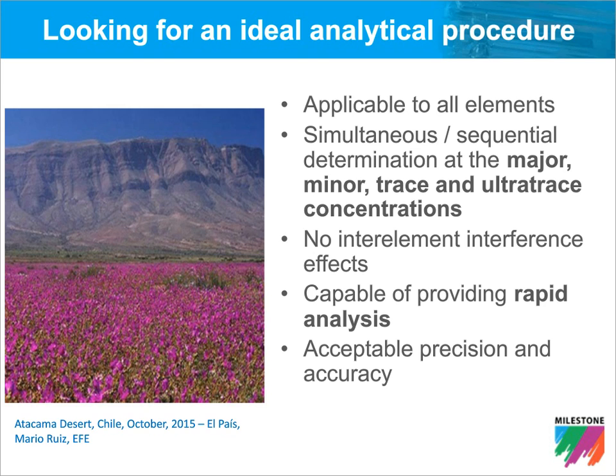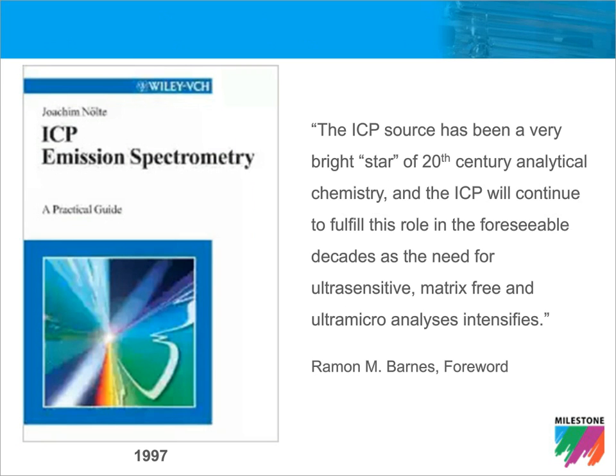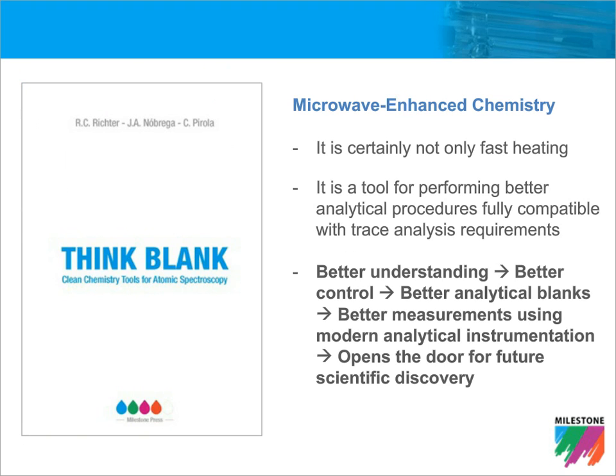As mentioned by Barnes, it is believed that ICP sources will continue to be used in the coming decades, and microwave-enhanced chemistry will allow better understanding and control, better blanks, and consequently, proper use of modern analytical instrumentation.